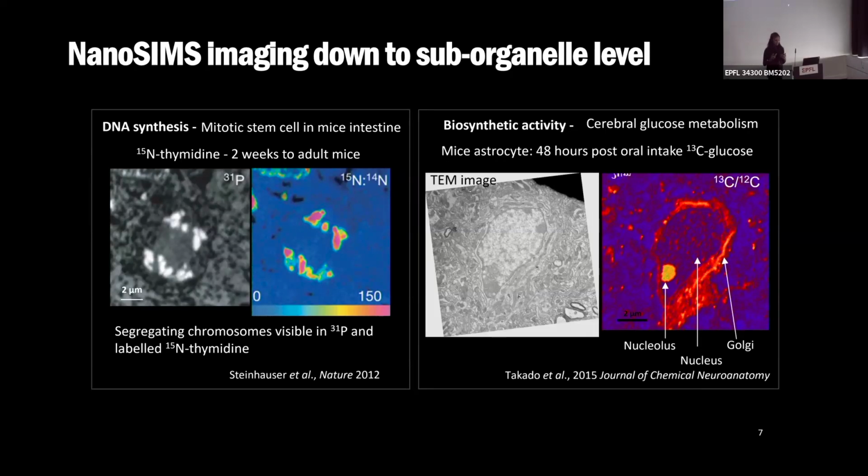So this is really interesting, again, to see the destination of a compound within a tissue, but it is really important to also remember that you can say a lot about the location of the isotope in the tissue, but you don't get any molecular information as to which compound this isotope is actually present within in this material.